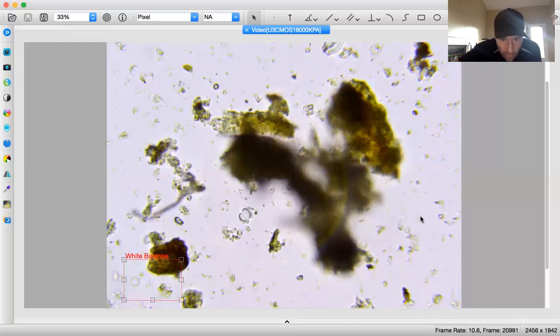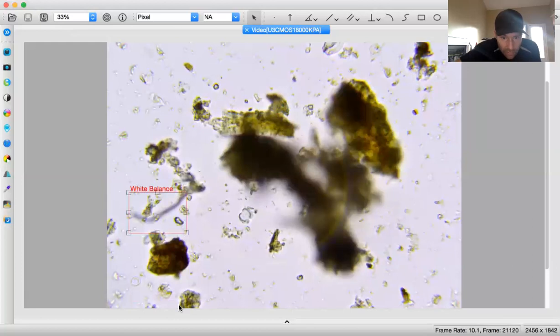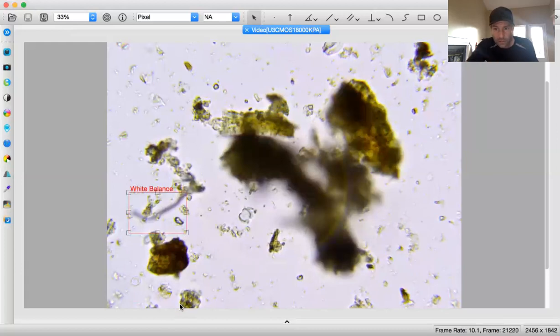So I don't see any other amoeba. It looks possibly like that might be a bacillus, possibly. Maybe some actino. It's so faint though. I'm not even going to deal with it. So I'm not saying anything here as well. Oh, that was a long flagella behind that flagellate that was moving right down there. That was the same one that was on top. So we're going to keep moving.